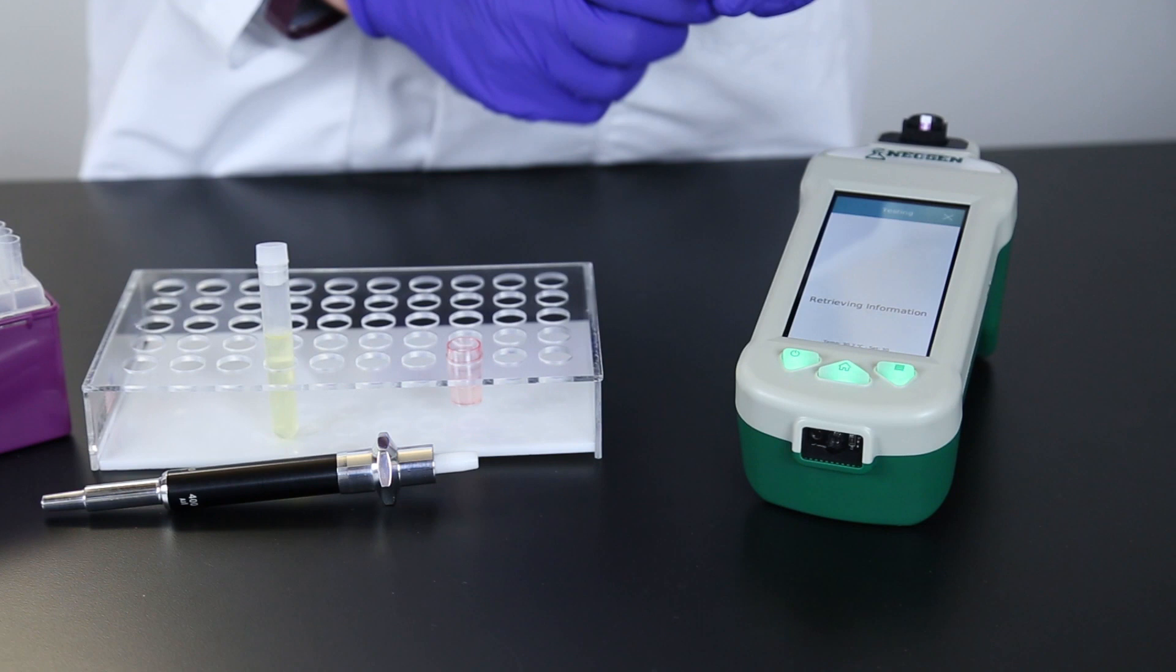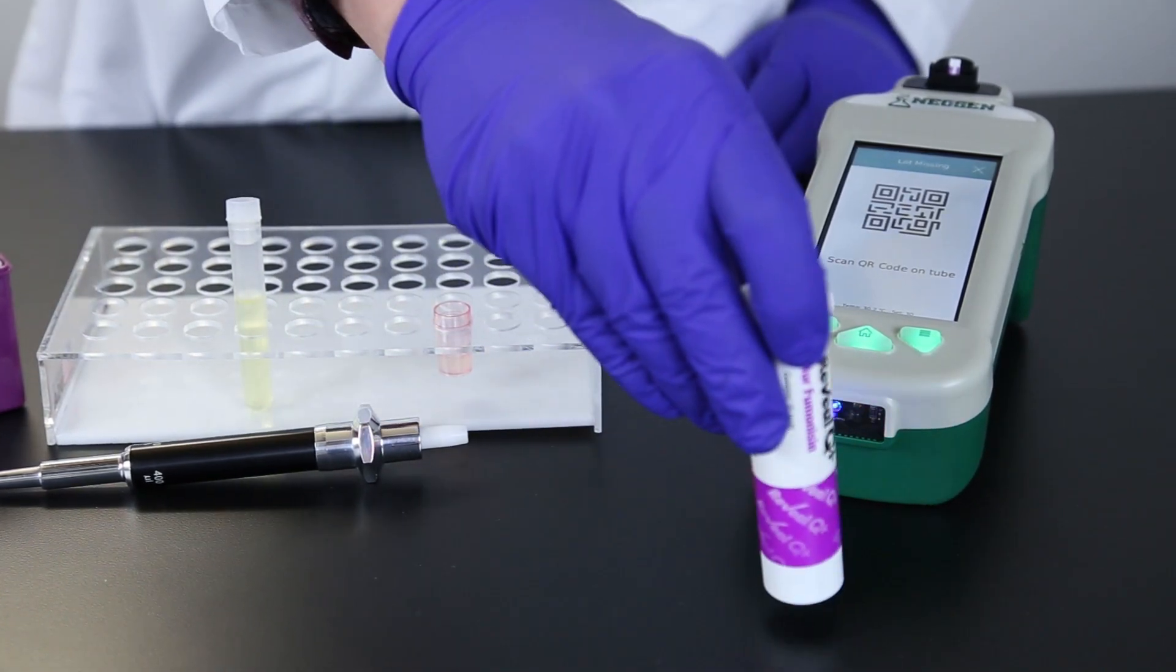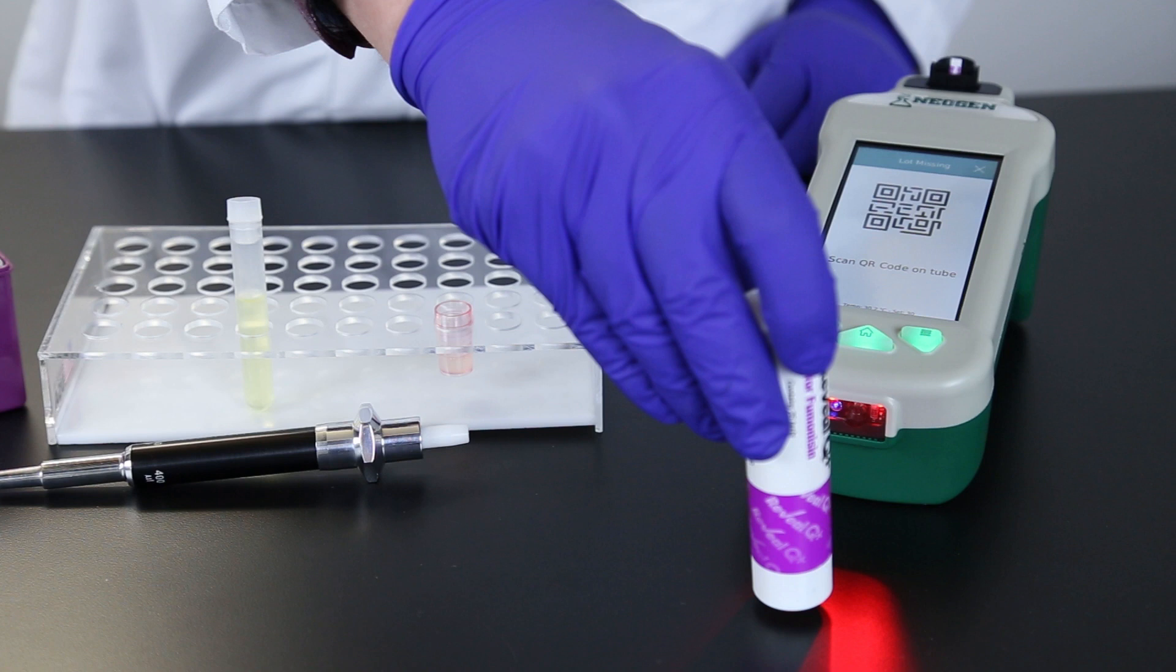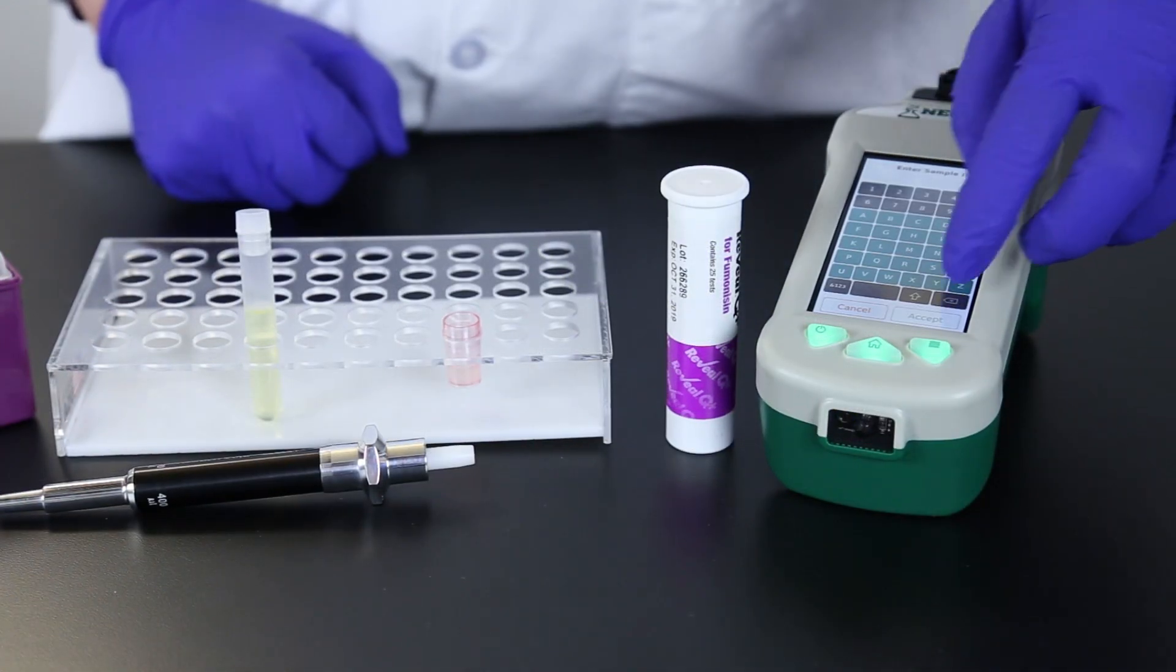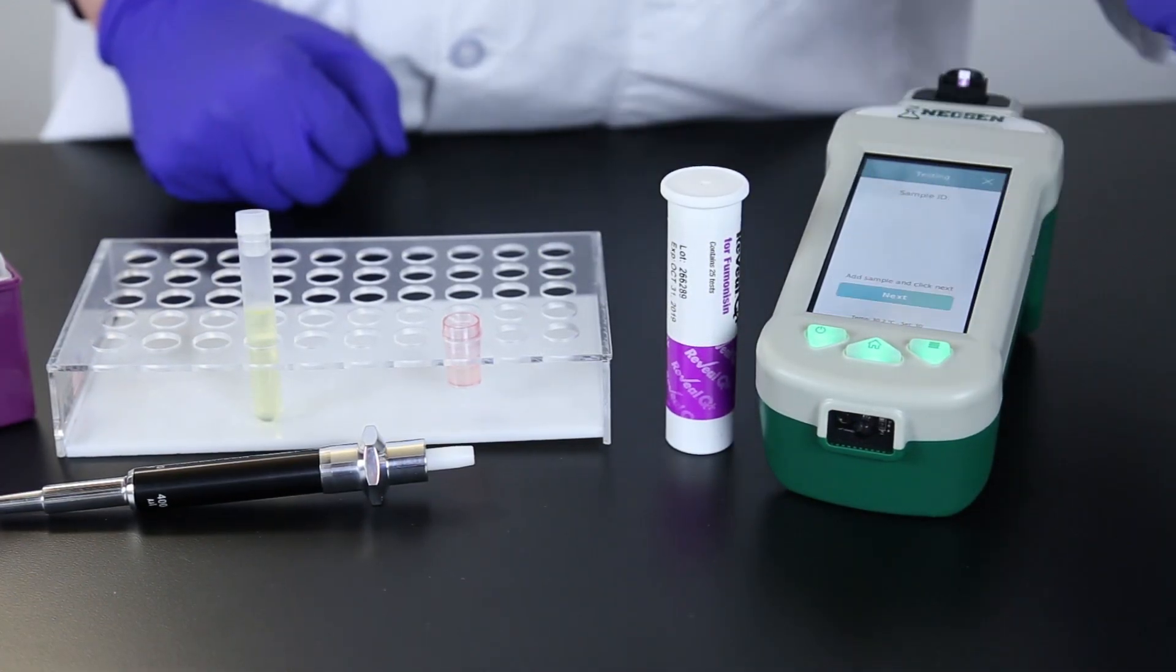If you need to add the lot information to the system, the scanner on the front of the system will turn on automatically. Scan the QR code located on the strip tube. Enter a sample ID if you like. This can be done manually or if you barcode your samples by using the scanner in front of the system.